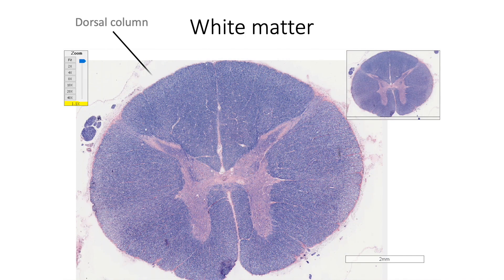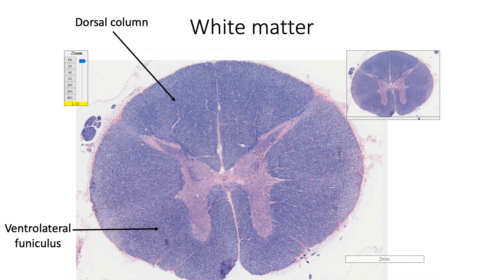Peripheral white matter forms the dorsal column between the posterior median sulcus and dorsolateral sulcus. The rest of the white matter forms the ventrolateral funiculus. The dorsal column contains fasciculus gracilis and fasciculus cuneatus. The ventrolateral funiculus contains ascending tracts like spinothalamic and spinocerebellar tracts, and descending tracts like corticospinal, rubrospinal, vestibulospinal, and olivospinal tracts.